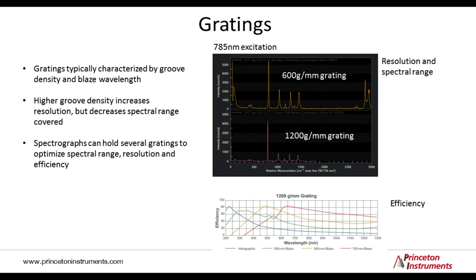So look, for example, to the figure on this page that shows two cyclohexane Raman spectra taken with two different gratings on the same instrument. The higher groove density grating will increase the spectral resolution, but shrink the spectral range observed on the CCD, so the spectrum cuts off earlier.